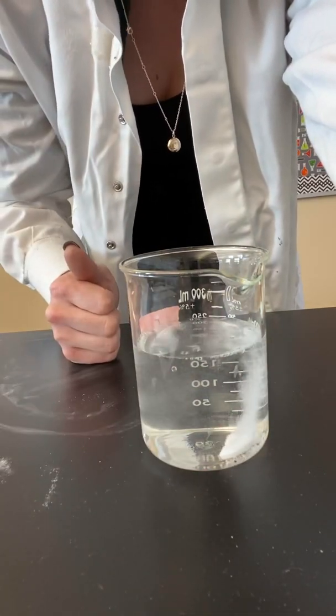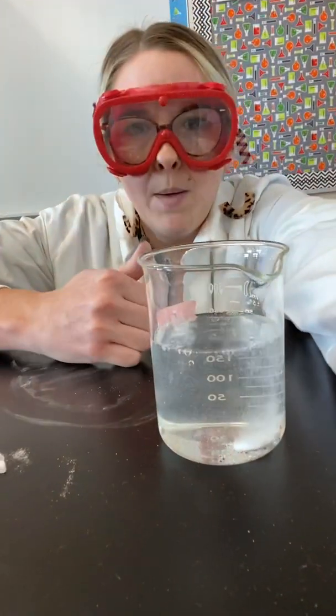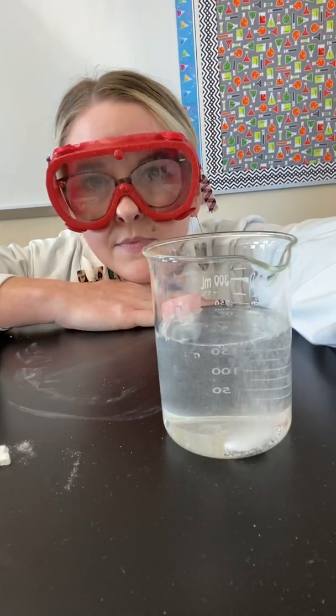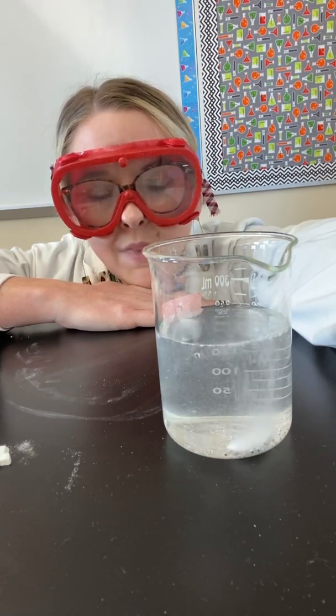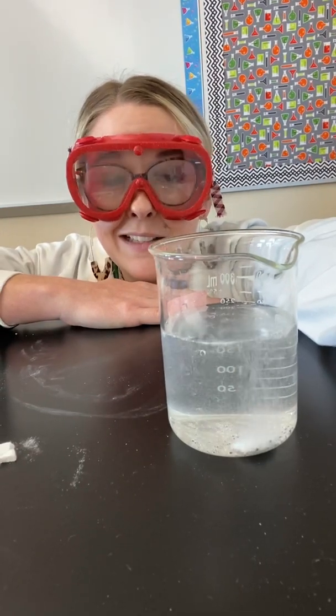That means that the reaction is happening. We know that this is a chemical reaction. So check out that bubbling that's happening. That's awesome. So it's still going. This one might take us the longest.